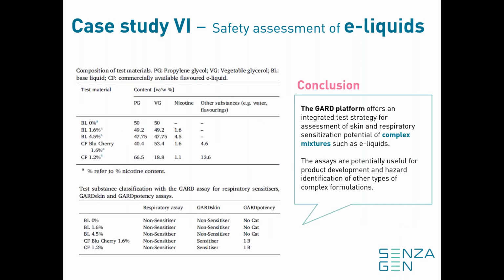So I think this slide basically demonstrates the GARD assay and how the different assays of the GARD platform can be used together in order to inform both on skin sensitizing hazard and potency, but also on respiratory sensitization. So for this specific study, the safety assessment was performed on an e-liquid, but I think that the same strategy can also be applied for other types of similar mixtures.